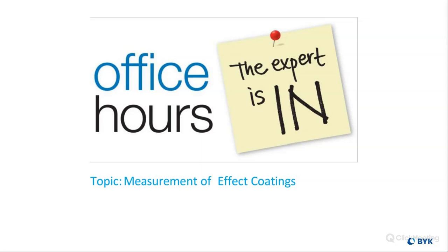Usually it'll be with another instrument. So if someone's using, let's say, a Spectro 2 Guide to measure one of these effect coatings, which is essentially, instead of having the different angles, it's just using the one angle. So it's using a 45 degree. And it's not telling the whole story of what that sample is doing. A lot of times people will try to compare results from the BYK-mac, which is the multi-angle, to the Spectro 2 Guide, which is the single angle. And their data will differ from each other, especially on the 45 degree angle.